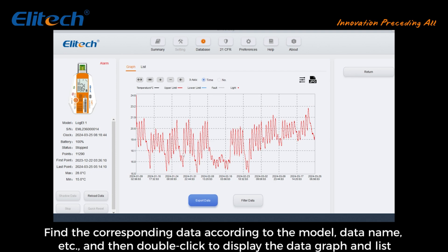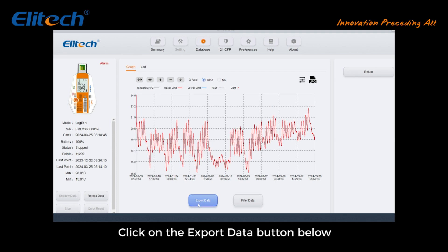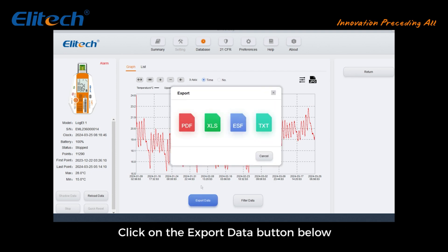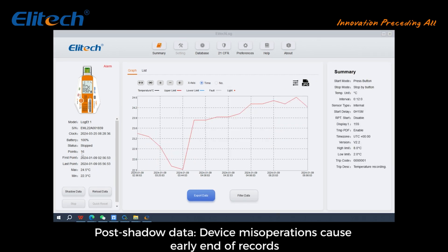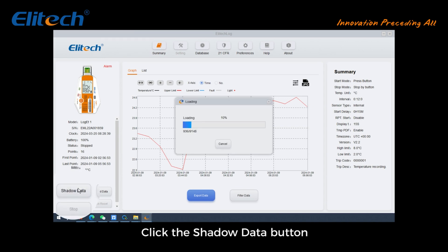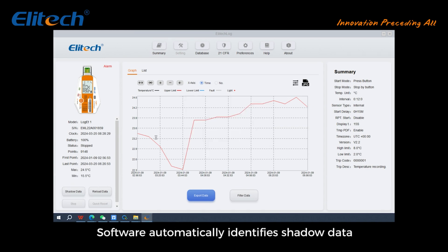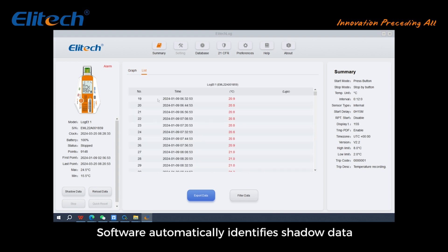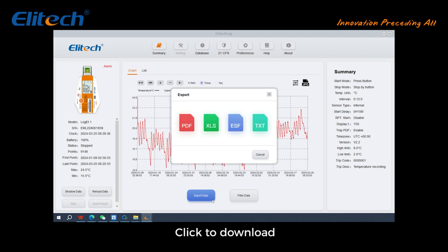Click the export data button below to save the data. For device misoperations that cause an early end of records, click the shadow data button — the software automatically identifies the shadow data. Click to download.